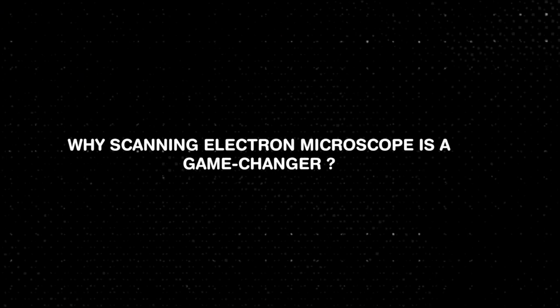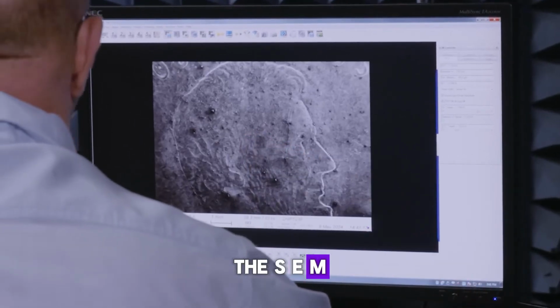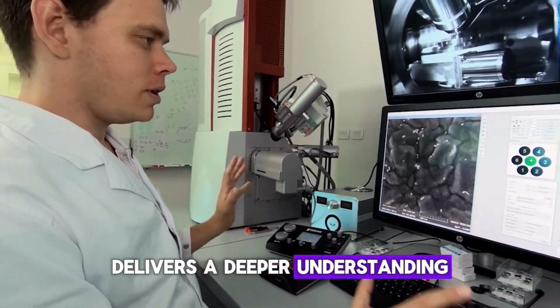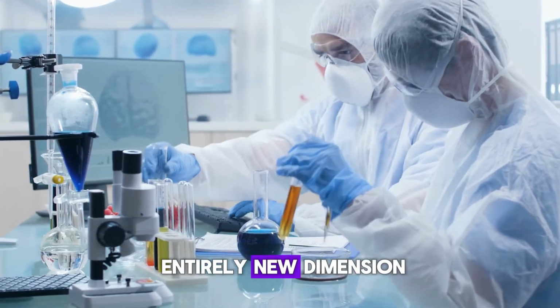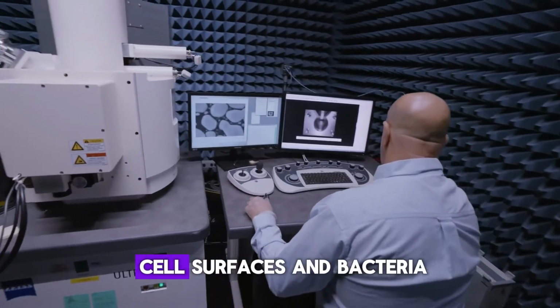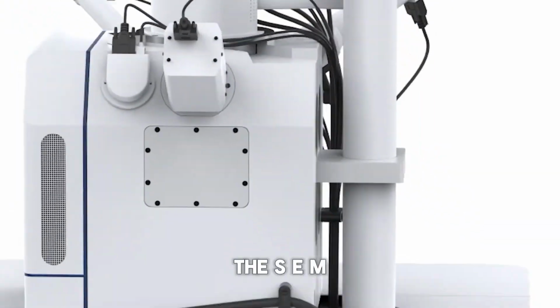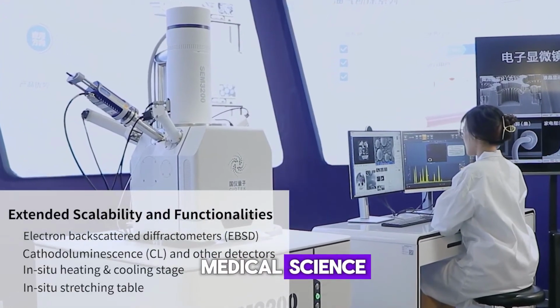Why the Scanning Electron Microscope is a game changer. The SEM not only provides higher resolution than traditional light microscopes, but also delivers a deeper understanding of surface structures. It's like unlocking an entirely new dimension in medical research. From helping us study cell surfaces and bacteria, to diagnosing diseases and advancing pharmaceutical research, the SEM is truly a game changer in the world of medical science.